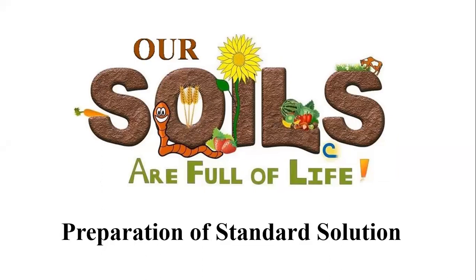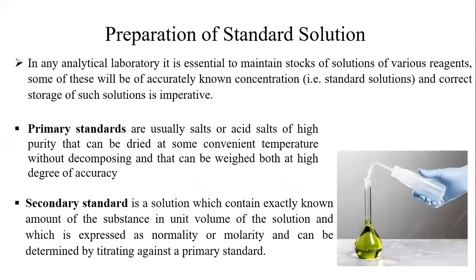This video is about the preparation of standard solutions, which plays a major role in chemical analysis and in soil analysis, particularly for a soil scientist. We place more importance on the soil science background. Let us see what a primary standard is.